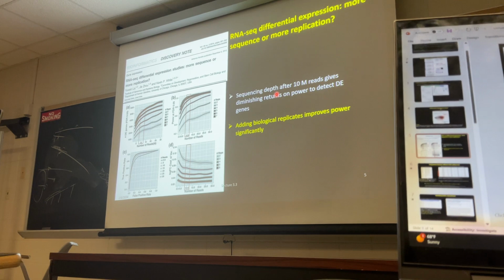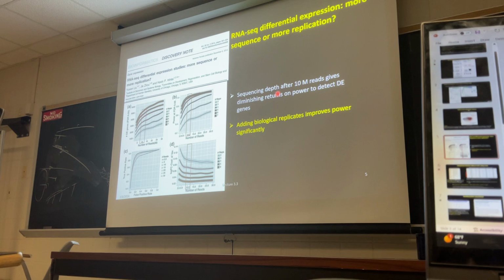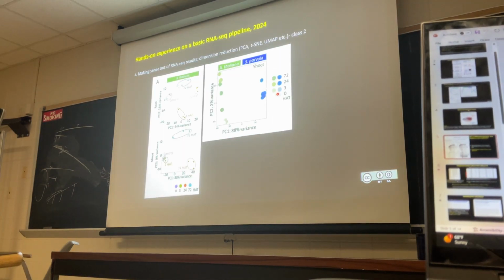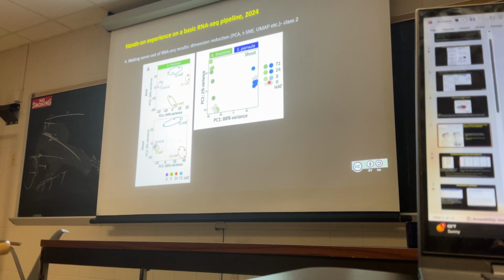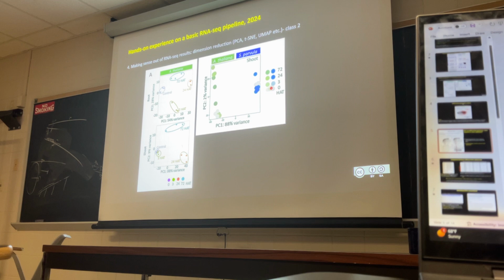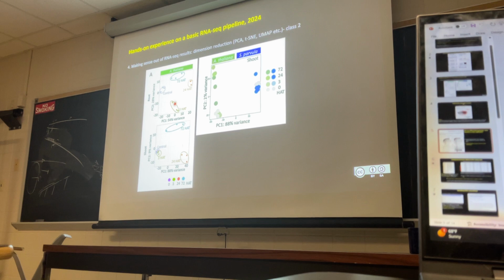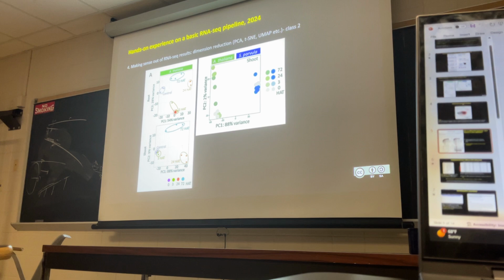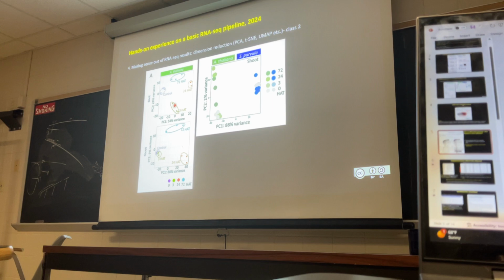If you read the DESeq2 manual, then you will see a way to do the batch correction. But that step you will decide only after seeing this principal component analysis or some other method that does the dimensionality reduction, like t-SNE or UMAP. Those are basically the same things here. So if the biological replicates don't agree with each other, for example one of these goes and stays here, and 2 of the replicates are here, then basically now you have to find solutions. What are you going to do with that sample, right?